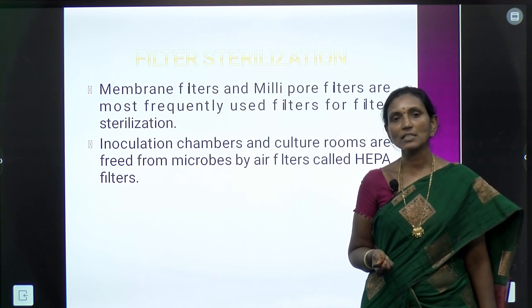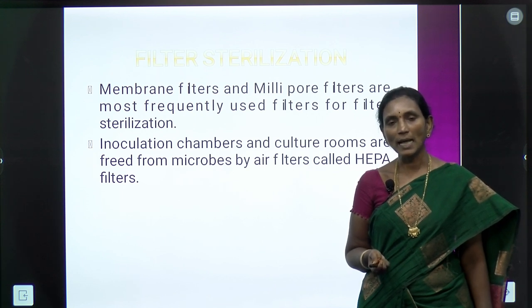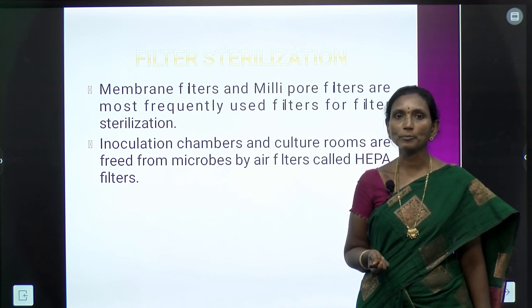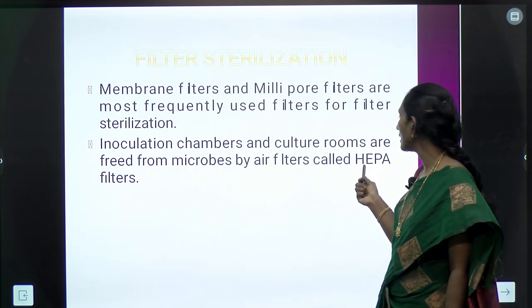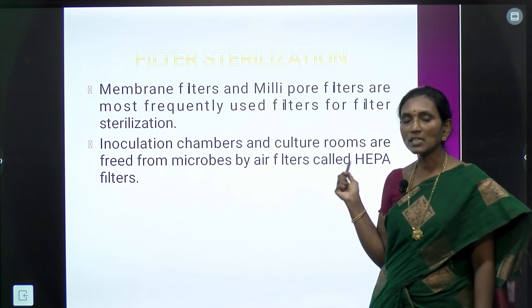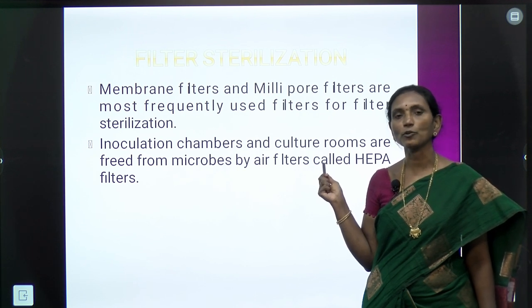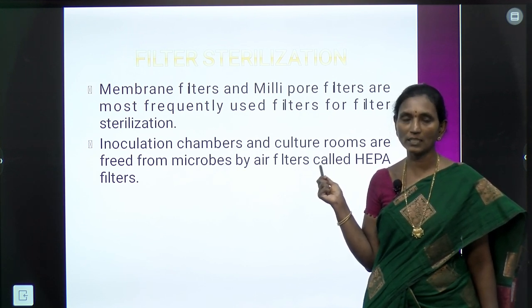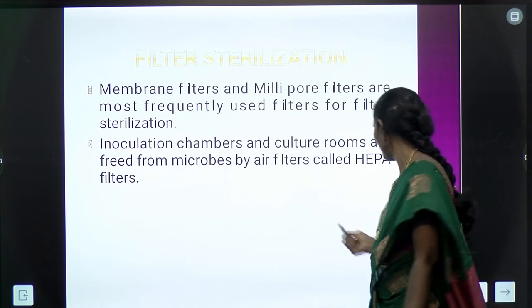I already discussed that this is done under laminar airflow chamber. In laminar airflow chamber, microbial free air is provided by HEPA filters, that is high efficiency particulate air filters. These HEPA air filters filter the microbes from the air and provide the microbial free air in the inoculation chamber or laminar airflow chamber.